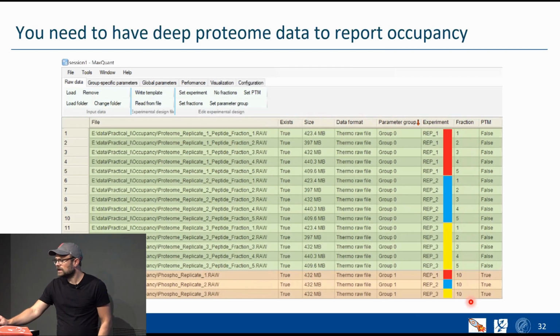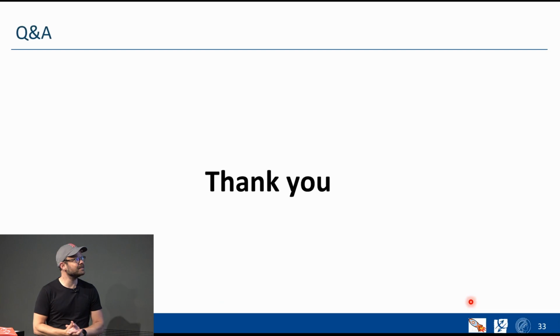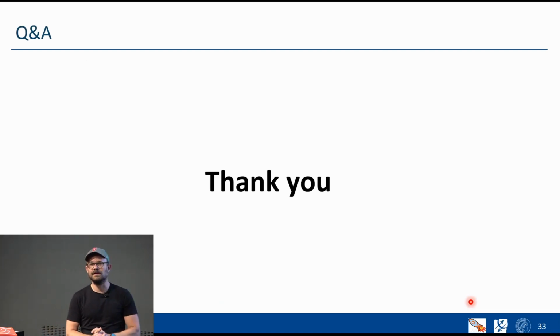Then you click start, wait a little bit, not too long, and you get your output tables, which are then handled in Perseus, and Carlo will show you how to proceed. That's it from the MaxQuant side.